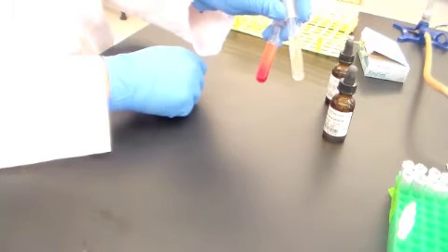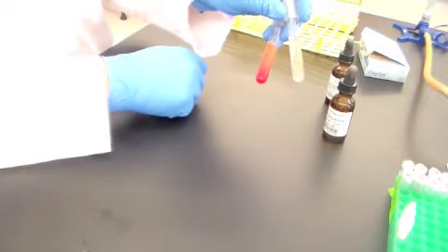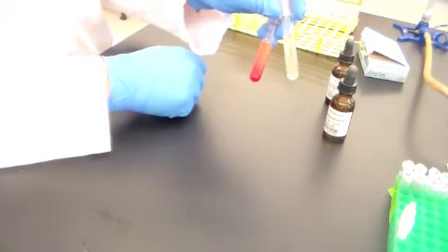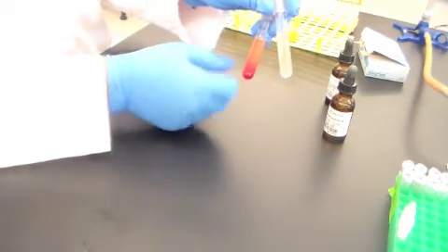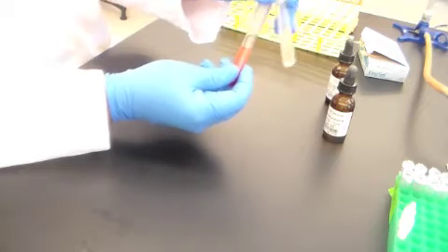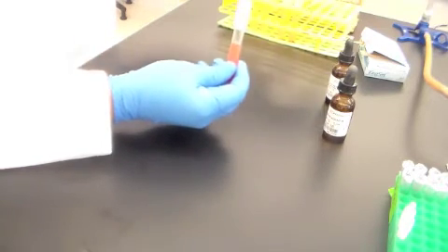Once nitrate was utilized in its entirety, this organism would likely have had to rely on fermentative metabolism, so doing fermentation to reoxidize its electron carriers, NADH. But in any case, this is a definitive positive test for nitrate reductase. And you can see that in the nitrate broth, there was initially no nitrites. So we can set this aside.